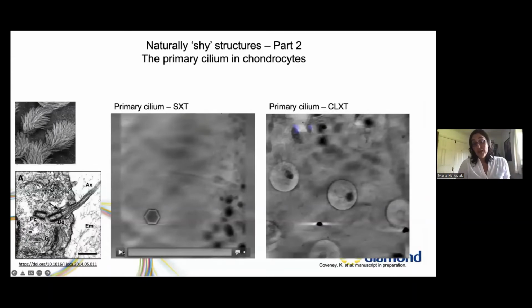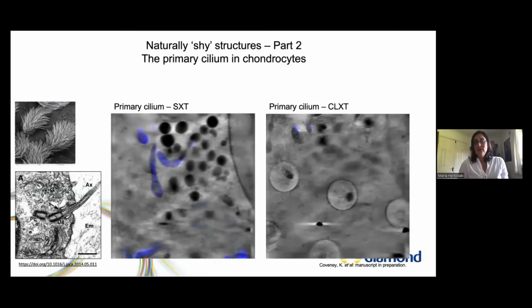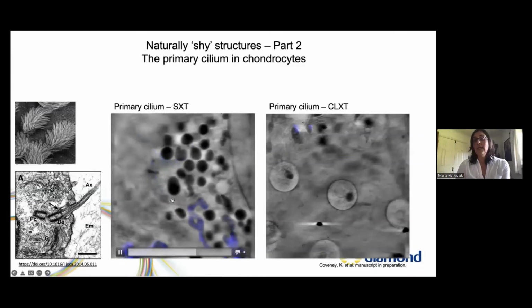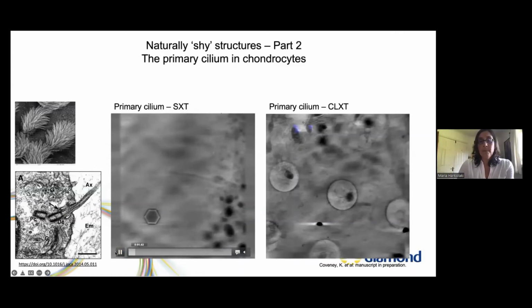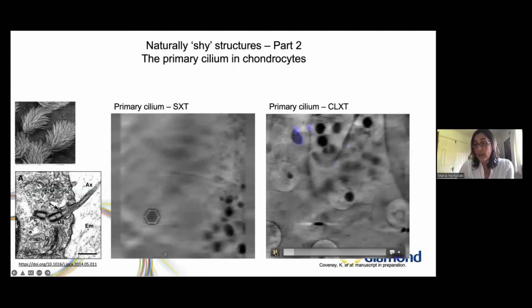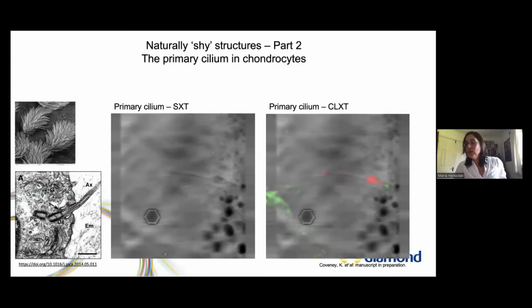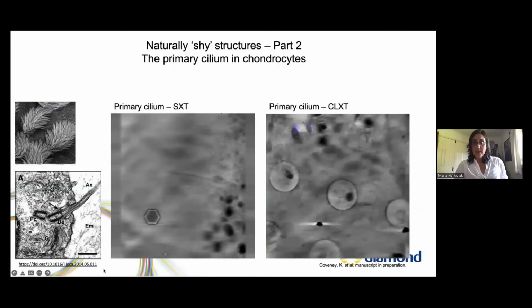We have projects, for example, here I wanted to show you this data we collected on a primary ciliated cell. We knew there was a cilium there, but regardless of the high amount of information, and I've labeled the mitochondria here, it was difficult to find the actual structure of the cilium. However, let's stop this one. Once you had the fluorescence superimposed, and then we're coming through the same cell, it's very obvious where to look to decipher the information we wanted, effectively the cilium, as you see here. All right.